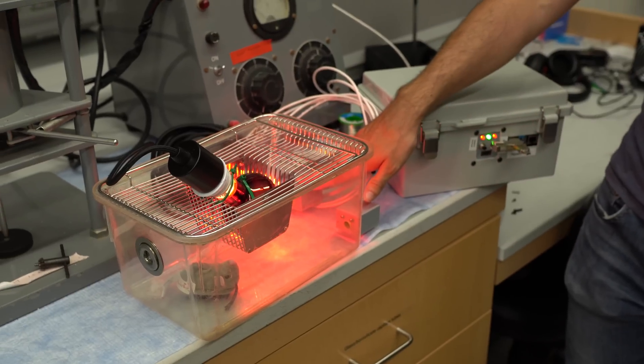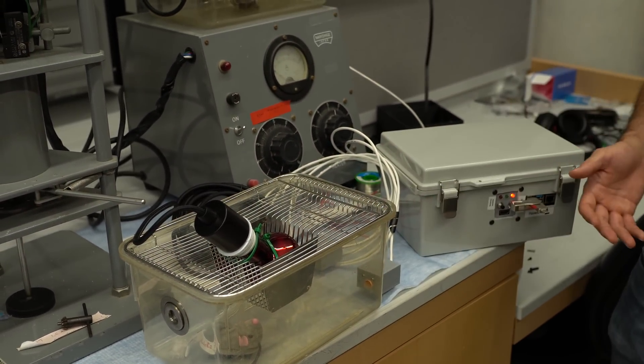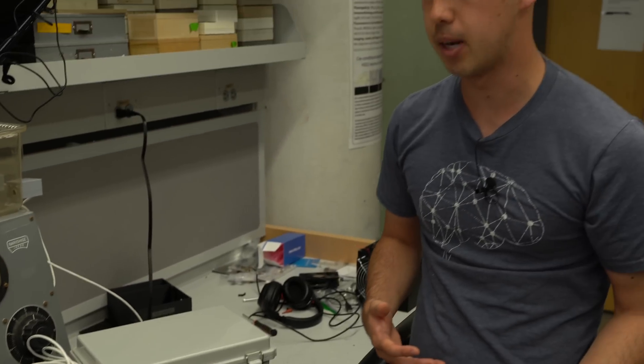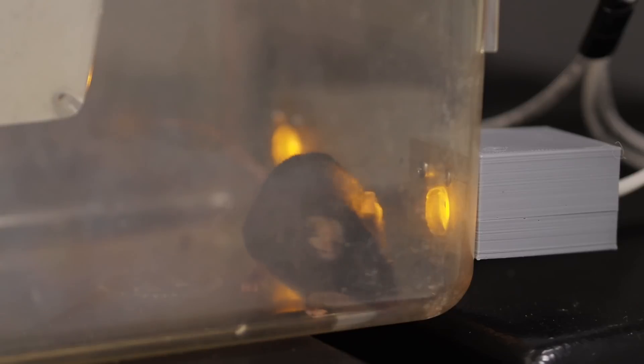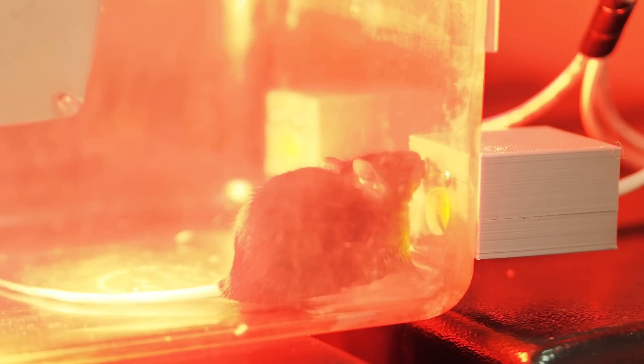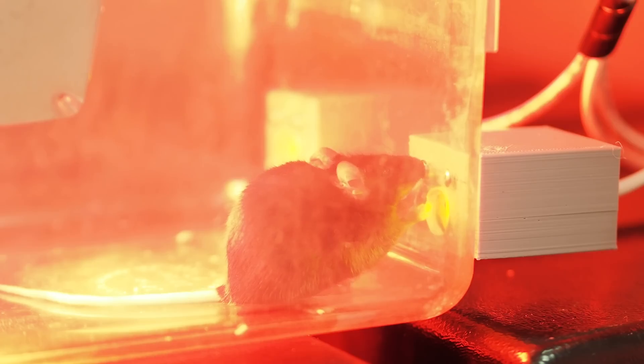So in addition to having the negative and the positive nose poke, we also do this with experimental mice and control mice that have not been manipulated. And we also do this at room temperature, as well as a warmer temperature and a colder temperature. So when we do this at a warm temperature, the mice don't need the heat, they don't want to poke. But when we do this at a cold temperature, they'll sit here and poke all day.